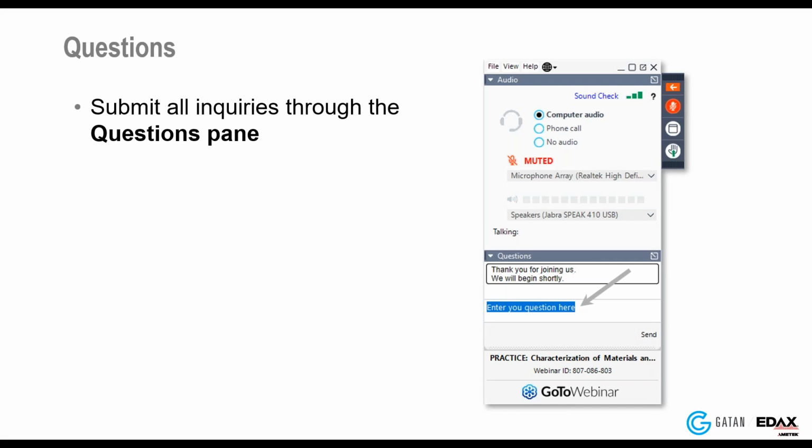I don't know whether you saw, but in some of the maps that I showed earlier, there were areas which didn't show lithium content, and they were regions where there was significant topography on the sample. Some of the other things that you need to consider is also sample charging. So charging is important to control. That can change the landing energy of the electrons, causing uncertainty and unreliability in the quantitative analysis, both the EDS and the BSE signal.